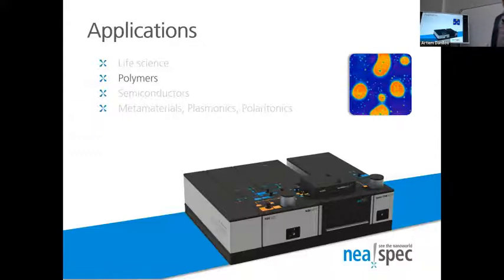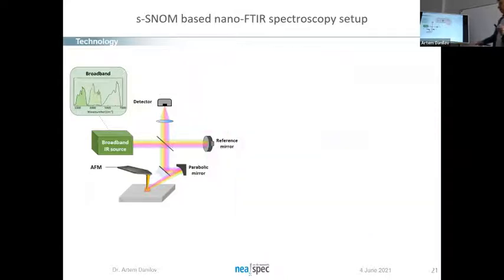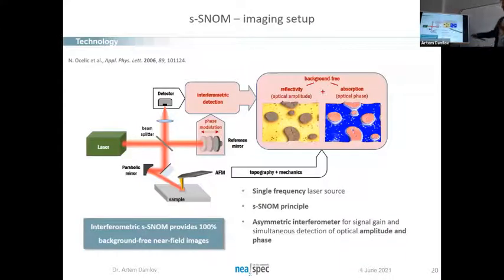Short question. As far as I understood, you're both moving the mirror and also keeping the oscillation on, right? Yes. The tip is oscillating at roughly 300 kilohertz, and the mirror is translated in nano-FTIR within a seconds range, more or less. On the previous setup, it's not translated. Instead, it's modulating because we're mixing some additional frequency into our setup. So it's creating some low frequency, and thus it's creating some sidebands. And these sidebands only correspond to near field. So this is near-field imaging.